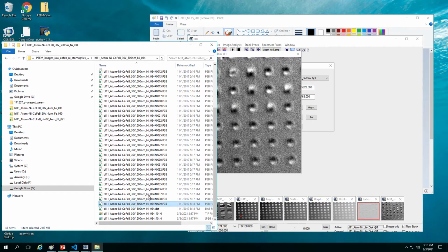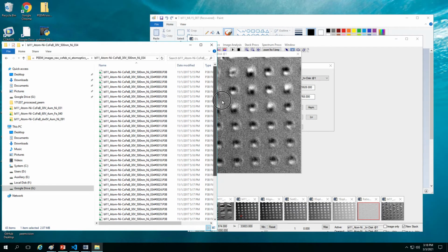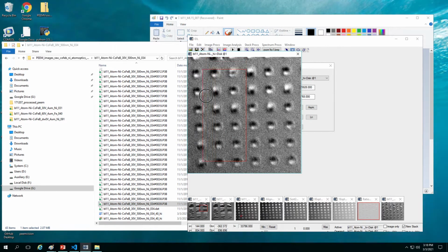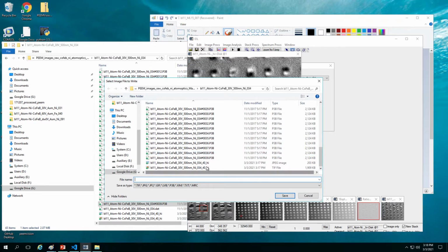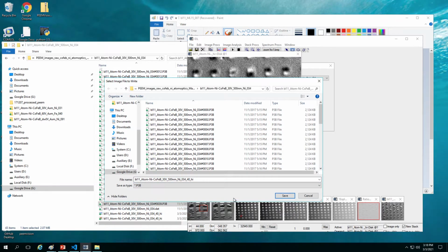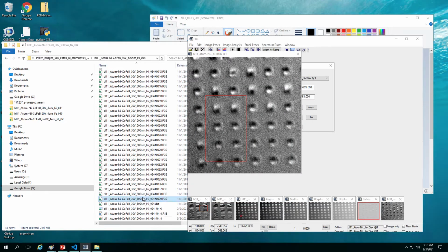Alright, so in the meantime we can check here. Let me get a P3B. Let me do it again. Alright, showed up here. So yeah, one image, 3 of them. I just want to see if we can get better.